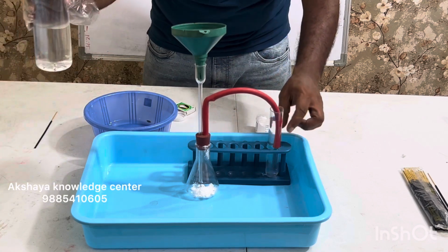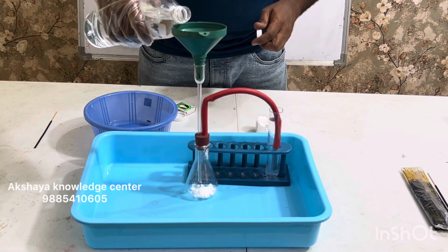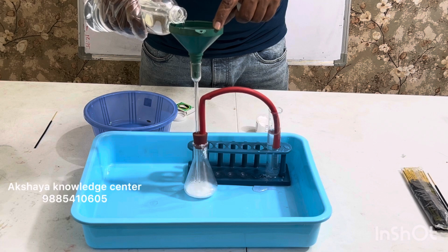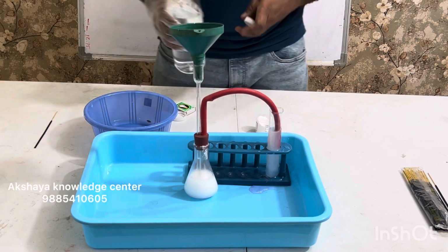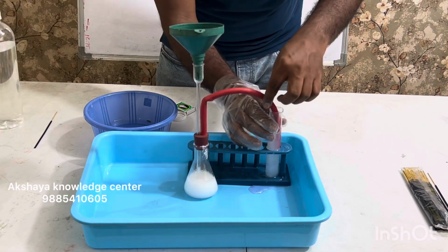Now I'll pour acid. Please observe the color of this lime water. Right now it is colorless. I'm pouring small quantities of acid in there. And you can see a lot of bubbling action happening over there. And I want to observe the changes in color. I'm pouring a little bit of acid at a time. Right, I think we did good. We can clearly see a color change. I can continue doing this, but let's look at the lime water.